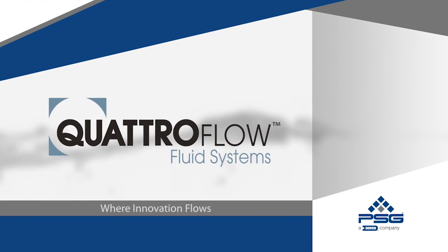Quattroflow quaternary diaphragm pumps, the safe choice for critical biopharmaceutical transfer applications.